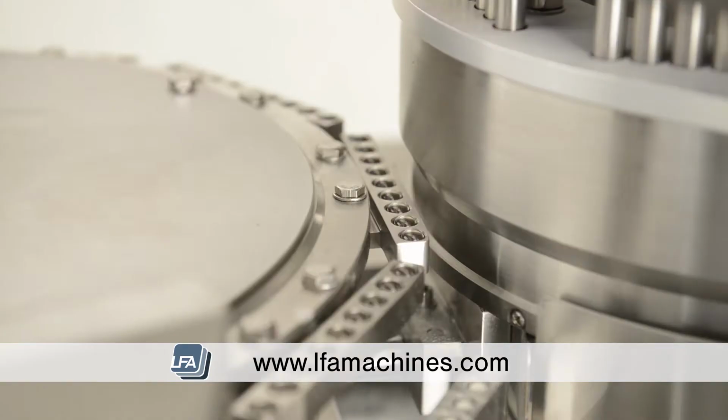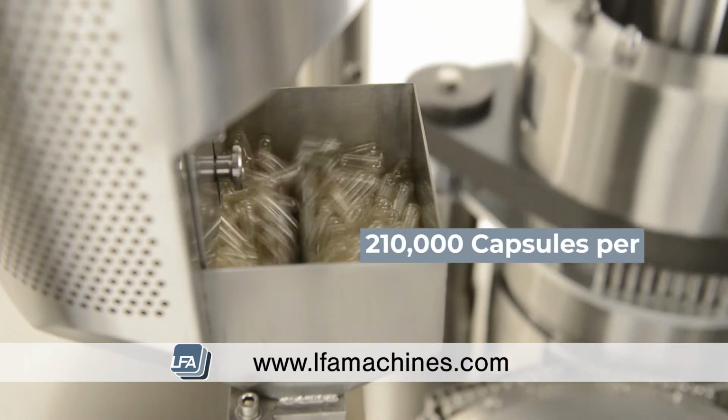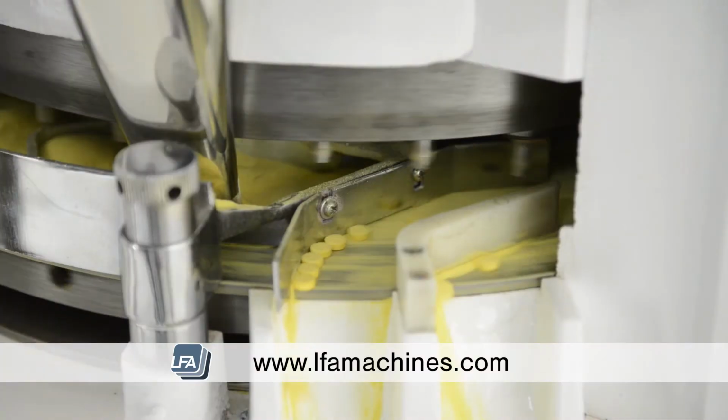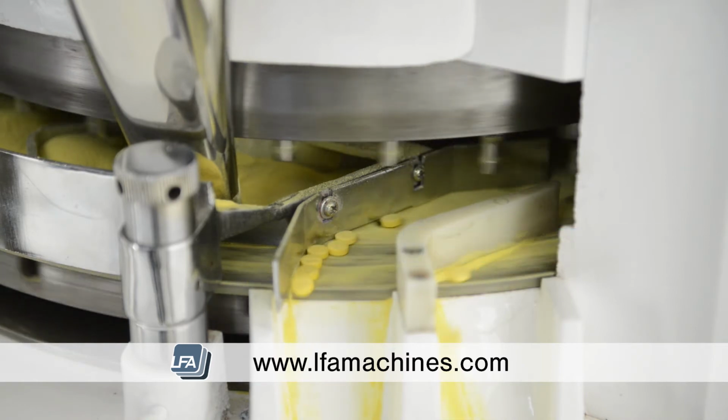Compared to tableting, capsules can be slow to produce. One of the fastest capsuling machines can produce around 210,000 per hour, whilst there are tablet presses which can produce around 1 million plus tablets per hour and generally have a lower unit cost.